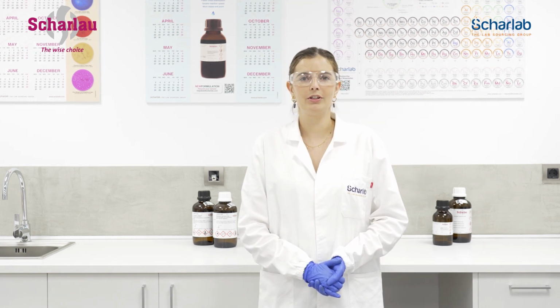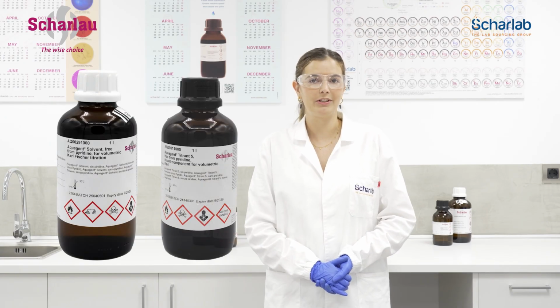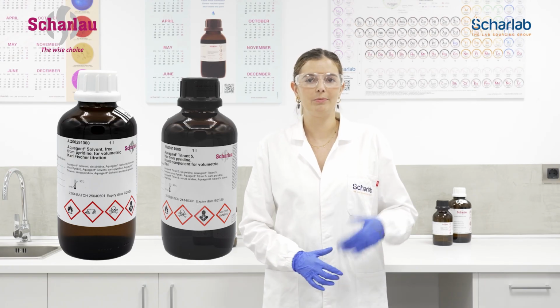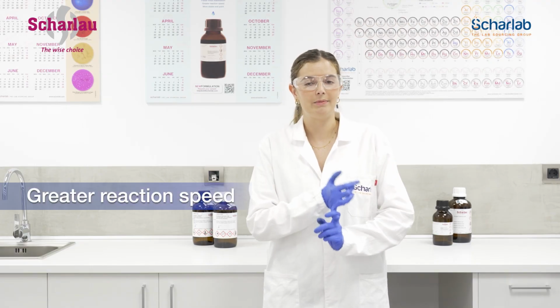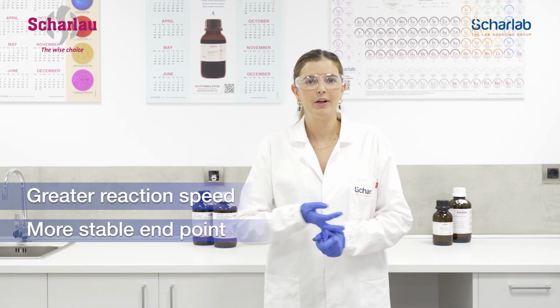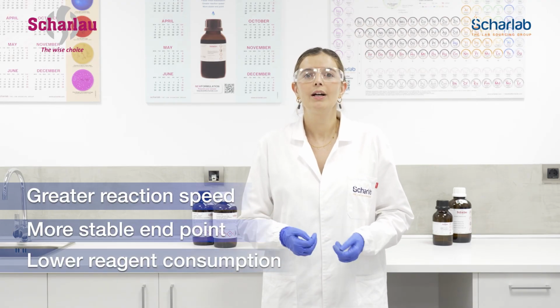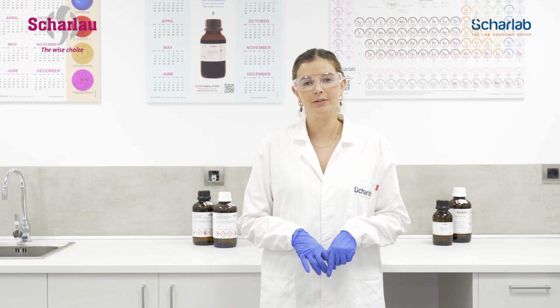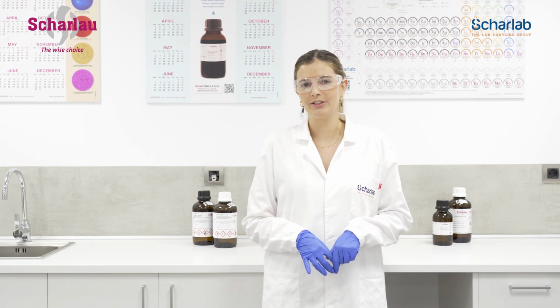Now let's look at titration with two component reagents. In this case, the solvent not only dissolves the sample, but also contains part of the components necessary for the reaction. Therefore, the components are divided between the titrant and the solvent. This offers some advantages: faster titration, a more stable endpoint, and lower reagent consumption. Also, since this system is more stable, it does not need to be standardized as often. Even so, it is not as versatile or as robust as the one-component system. That is why the one-component system is the best seller.